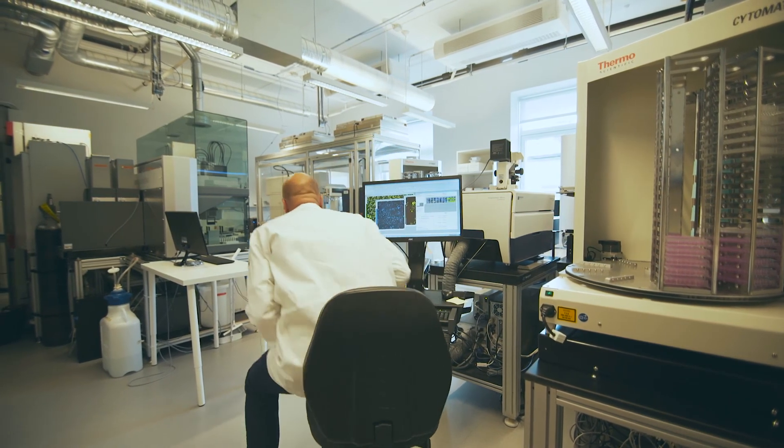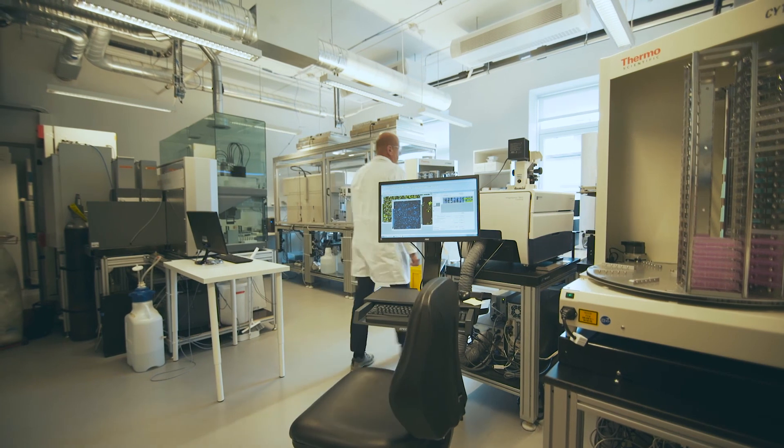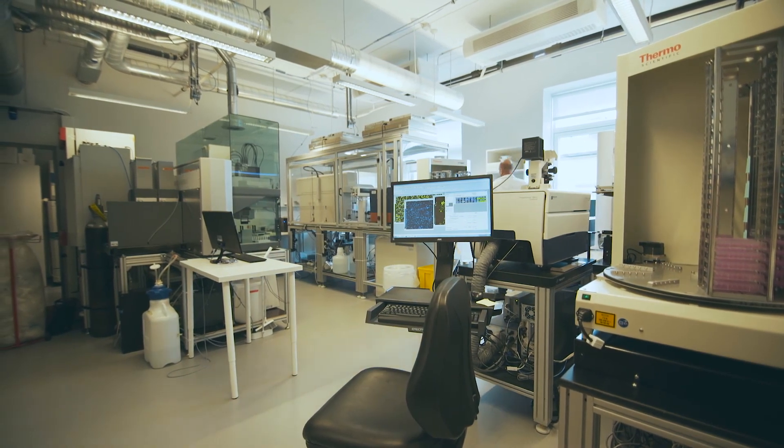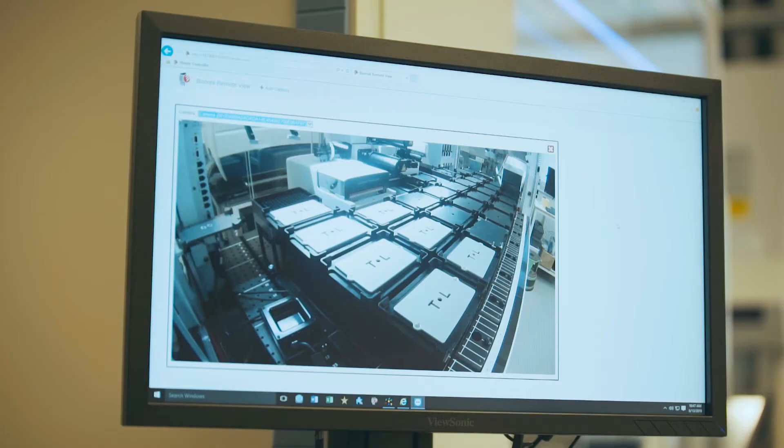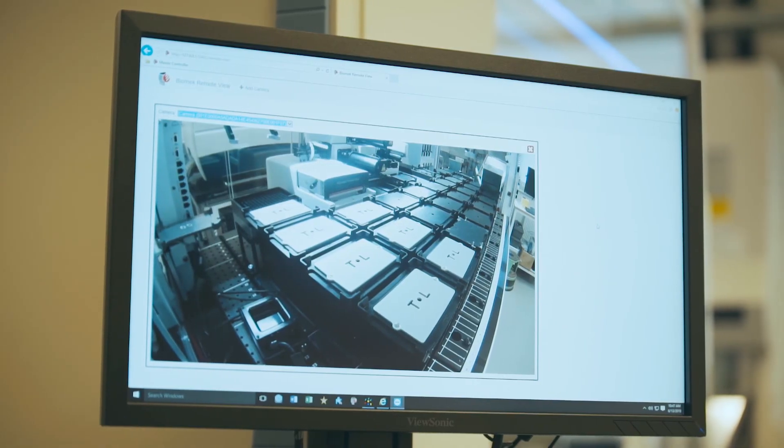Instead of working late hours to check the confluence of your culture, you can program the Biomech to do it. The on-deck cameras can capture the deck, making the remote viewing of images possible.